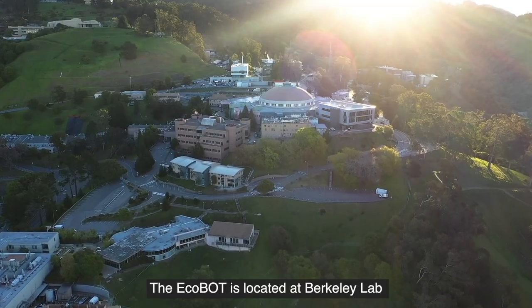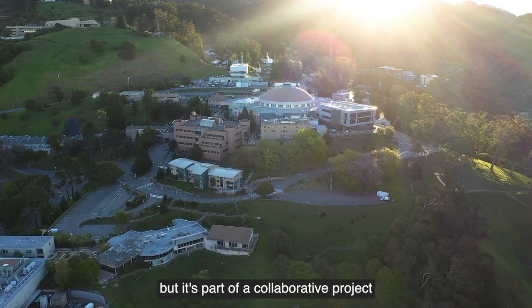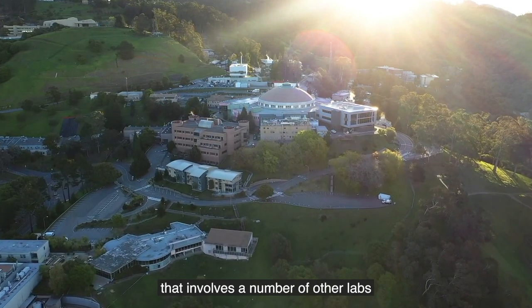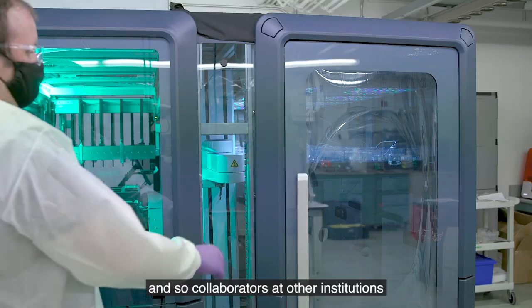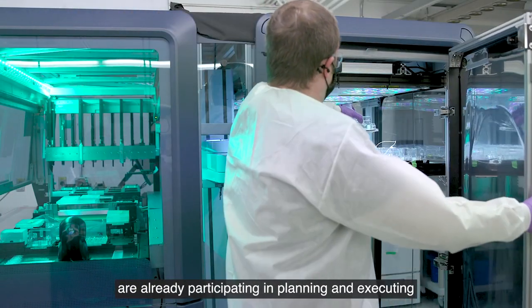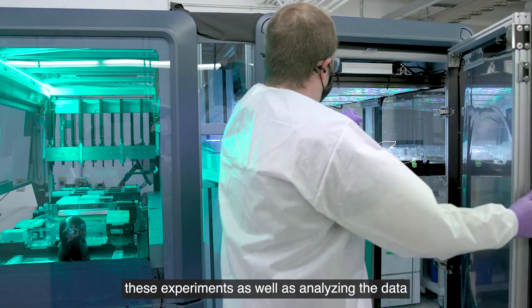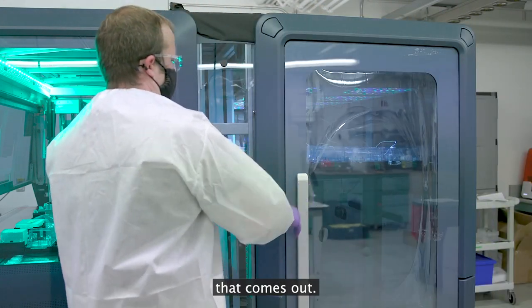The ECOBOT is located at Berkeley Lab, but it's part of a collaborative project that involves a number of other labs, in particular the Pacific Northwest National Laboratory. Collaborators at other institutions are already participating in planning and executing these experiments as well as analyzing the data that comes out.